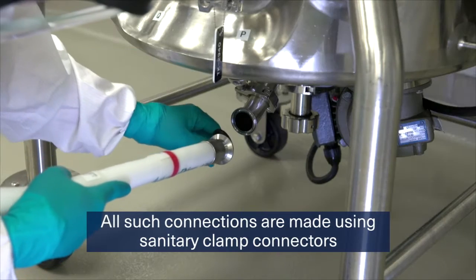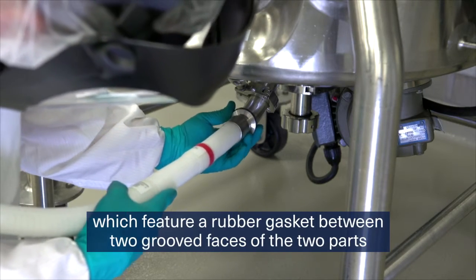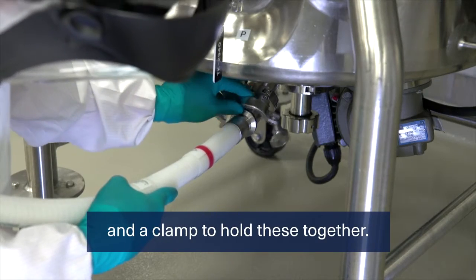All such connections are made using sanitary clamp connectors, which feature a rubber gasket between two grooved faces of the two parts and a clamp to hold these together.